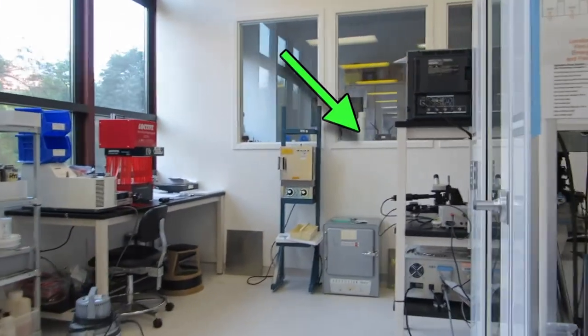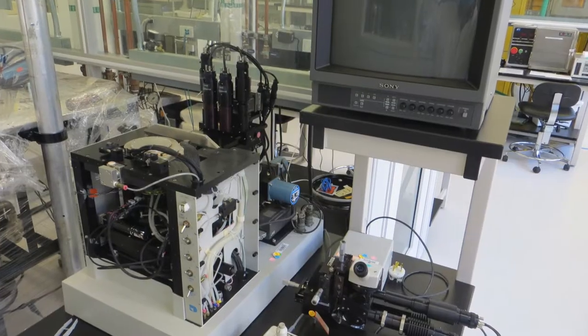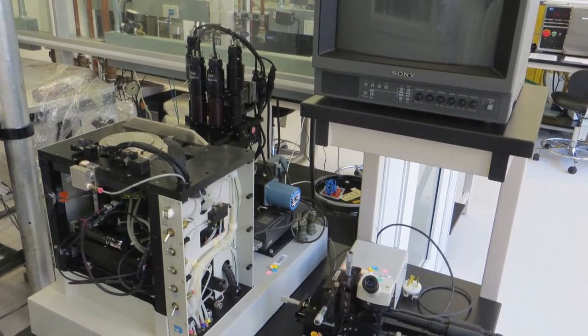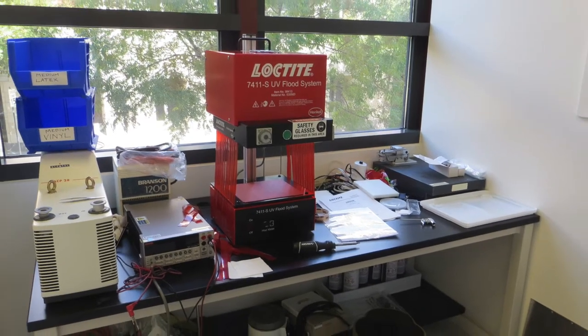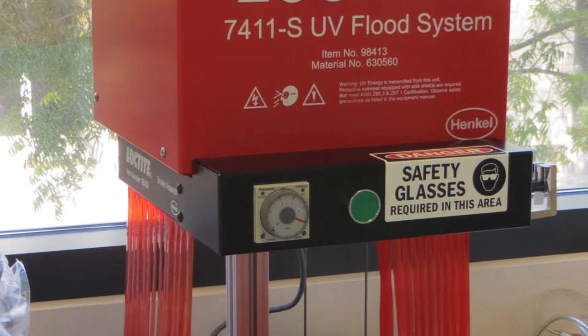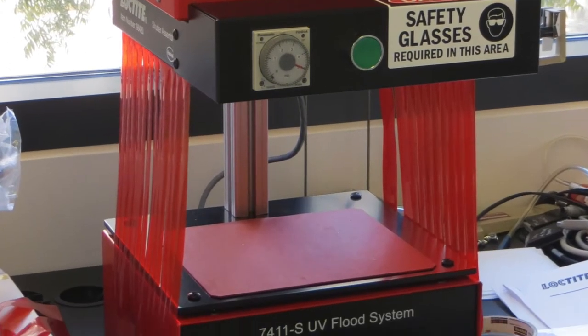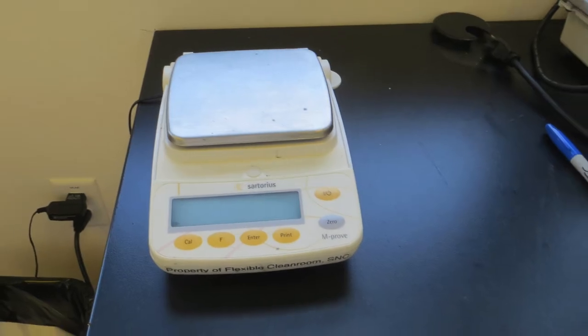Back in this corner of the lab is the flip chip bonder and also the Loctite UV exposure tool for doing blanket exposures and UV curing of optical adhesives. There's also a digital scale right here.